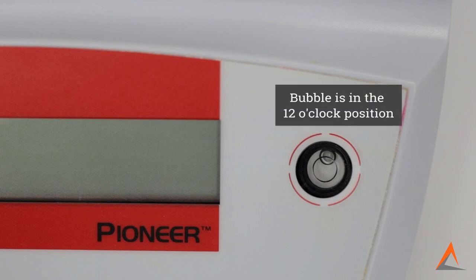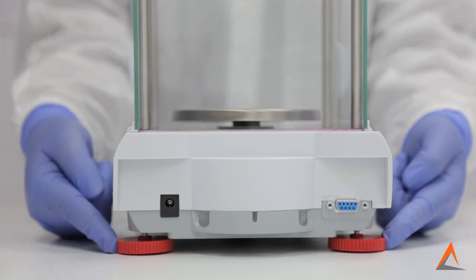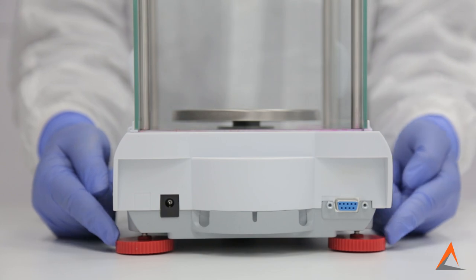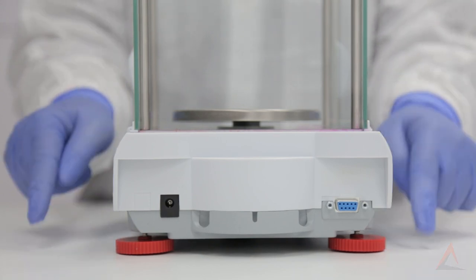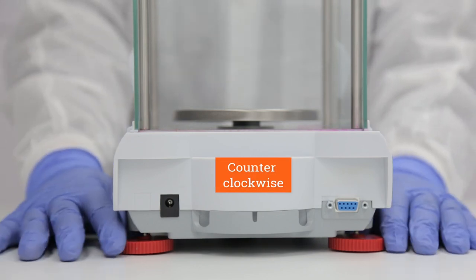If the air bubble is in the twelve o'clock position, this translates to the back of the balance being too high. Therefore, I would need to lower the back two feet. In order to lower the back, I am going to turn both back feet counterclockwise until it is also vertically level.